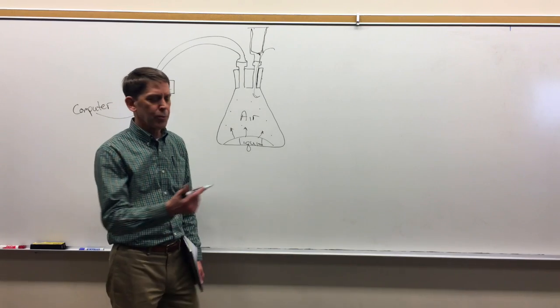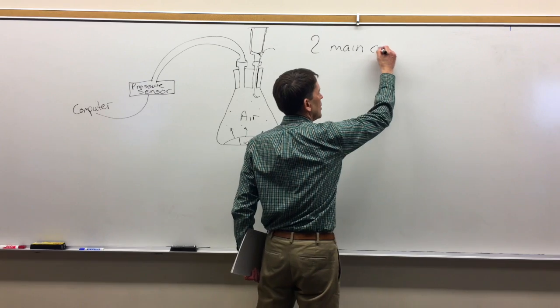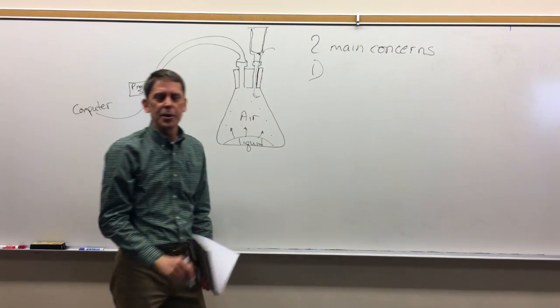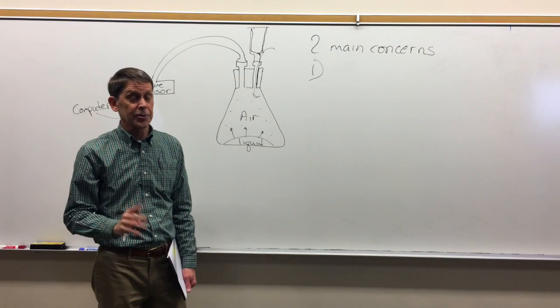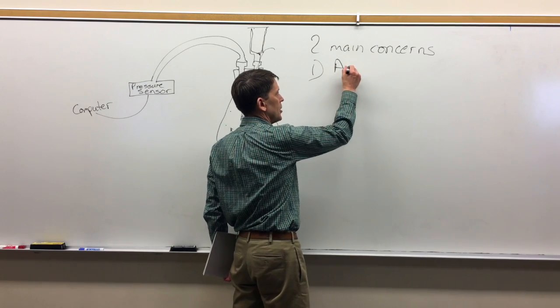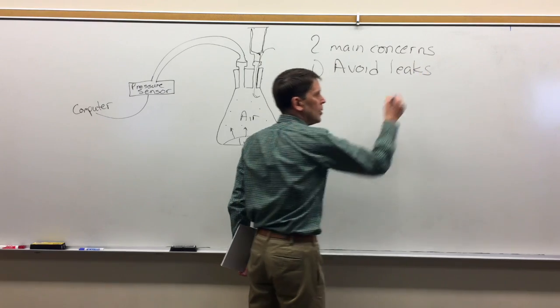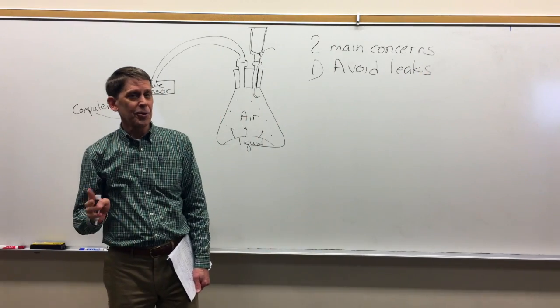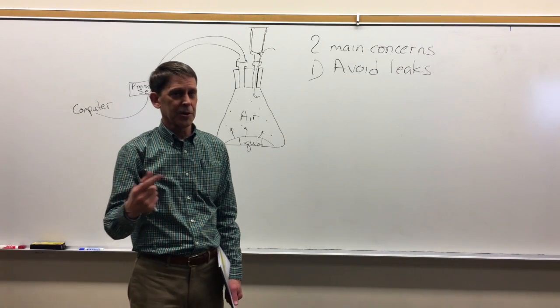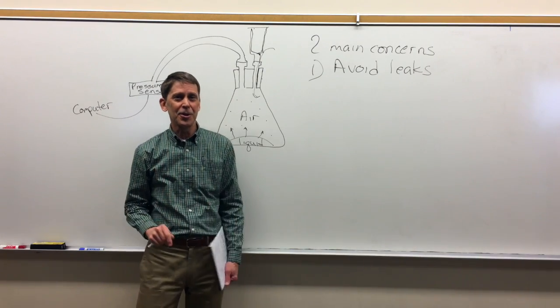There are two main concerns that have to be paid attention to in order to get this good data. The first one is that you have to avoid leaks in the system. We've got to make sure that when we get the system sealed and we're measuring the pressure after we get the liquid in there, and as the liquid's going in, that there are no leaks at all.